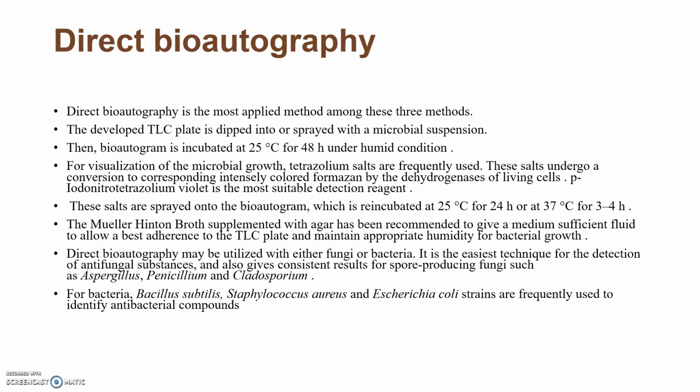This is the easiest technique for the detection of antifungal substances and also gives consistent results for spore-producing fungi, such as Aspergillus, Penicillium, Cladosporium. These are all spore-producing. And also for bacteria, Bacillus subtilis, Staph aureus and E. coli are frequently used to identify antibacterial compounds.